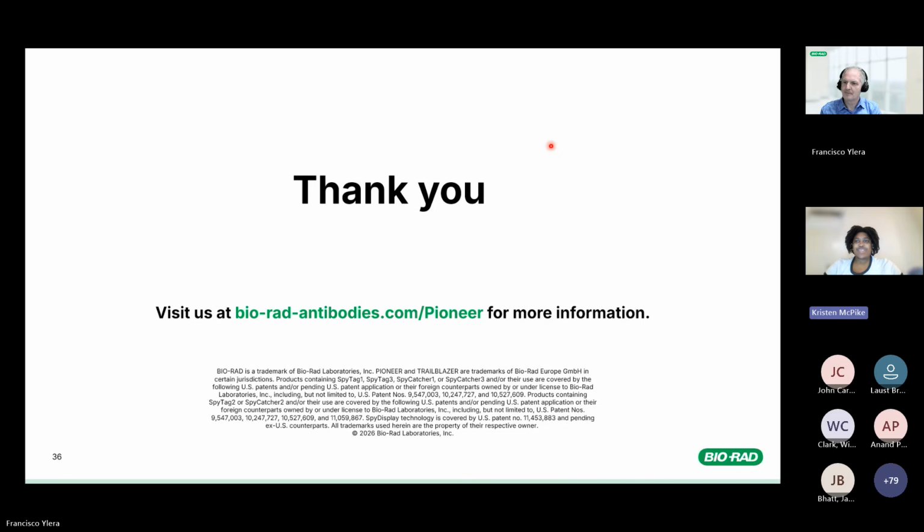Super exciting innovations we're discussing here. Next question comes from Alan Engemelmo. And Alan says, it is reported an unexpected frame shift from gene to expressed protein in a phage displayed peptide library from Caracamo, Rivera, and Brissett et al. From 1998. And Alan linked that article in the chat if you're curious. Could you comment on this based on your experience? Have you ever faced this issue with phage display libraries?